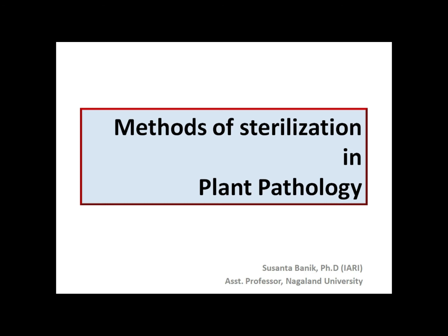Microbes are there in air, soil, water, and even the food we eat, the water we drink, or the materials we use. So, in a laboratory setup, when we decide to work with one or only a few microbes, we need to exclude the remaining ones. Here, sterilization is the process that we follow.